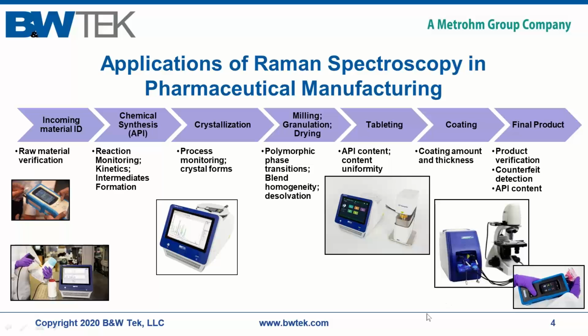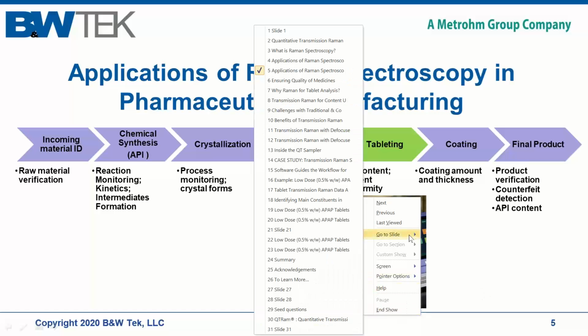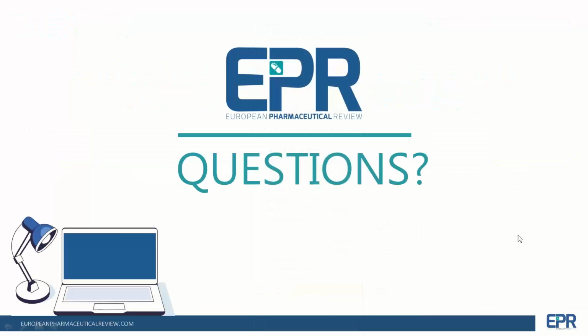Lovely, thank you, Catherine, for clarifying that one. Our next question is how many samples are needed to develop a calibration? That too depends on the number of, well, let me say you would need at least 15 samples spanning the concentration of interest. So it's best to have samples.